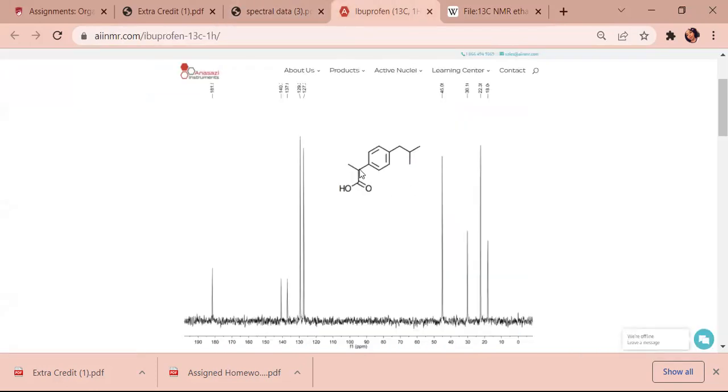And it's definitely not going to be this one, because again, we already pointed out that it's going to be a little bit more downfield because it's attached to a carbon that is being super deshielded. So because it still is a carbon on carbon stretch, it's likely going to be either this one or one of these. I believe that it's likely going to be this one, just because it still is a little more downfield than whatever one this is. So now we have about 19, which is still around that 20 mark.